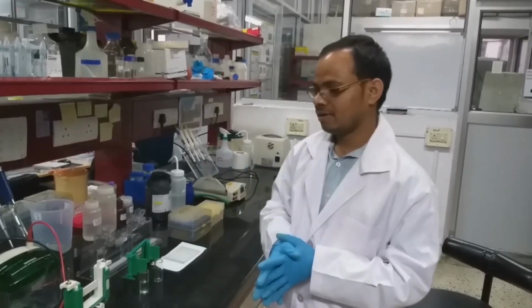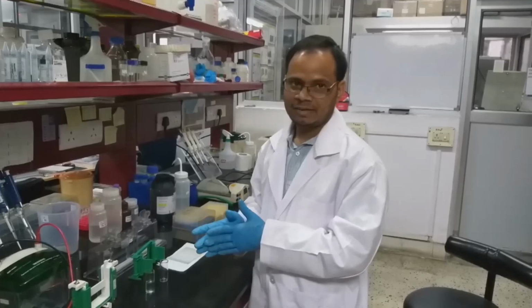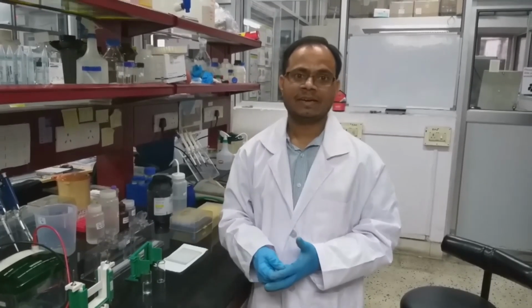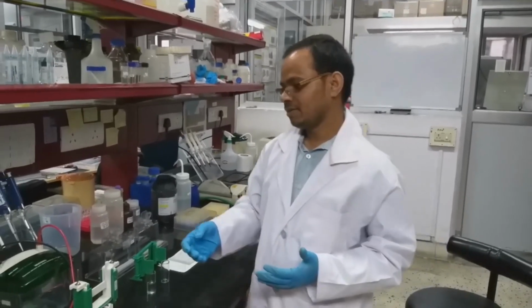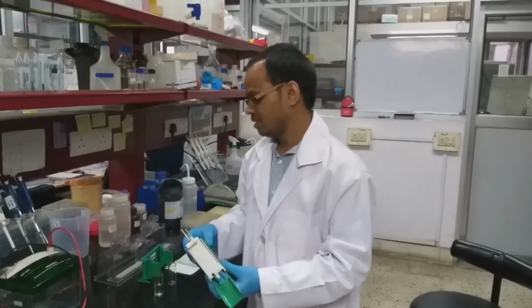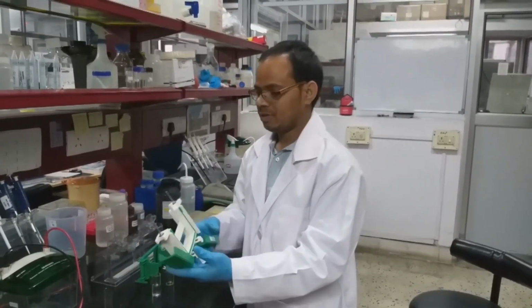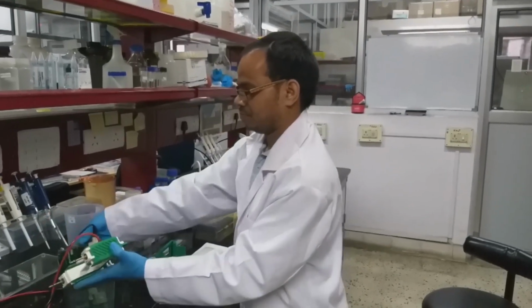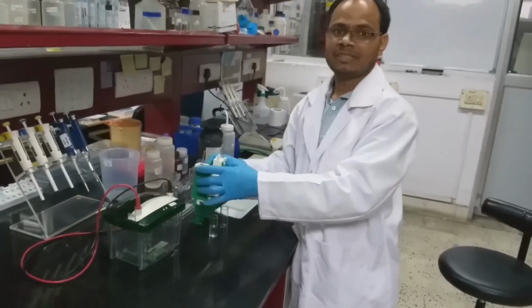So after preparing the gel, we will load the marker and the protein, which is denatured at 100 degrees Celsius for 3 minutes. After that, we will fix this gel into this one. We will keep in this reservoir.